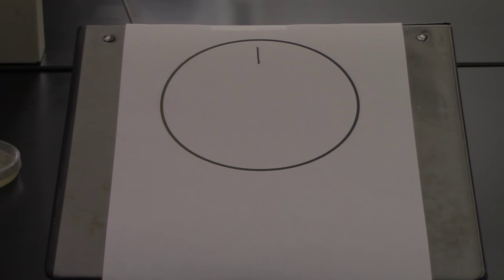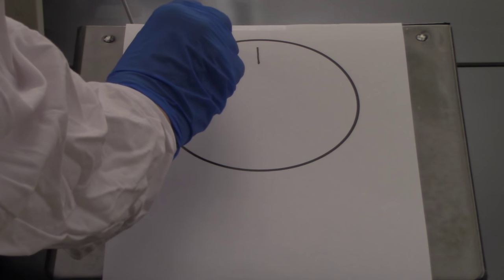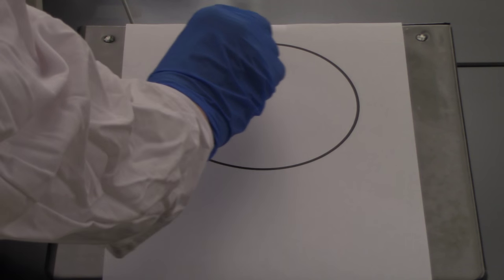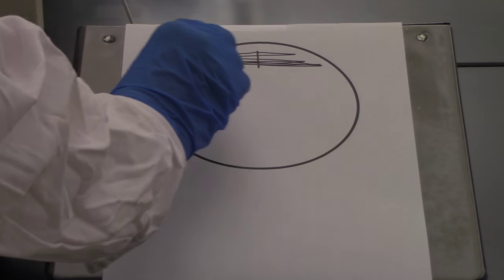Then I would take my loop, sterilize it, let it cool, and I would go back through this smear several times. What I'm doing here is trying to spread and thin this out, going all the way across but staying near the edge of the plate.